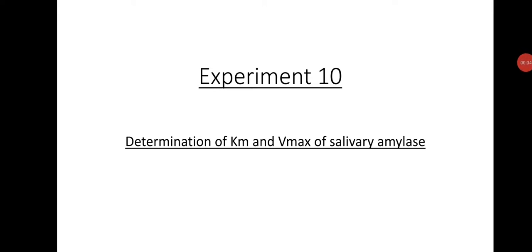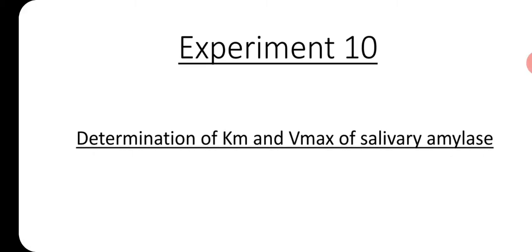So moving to the last experiment of BTY106, the aim of this particular experiment is determination of Km and Vmax of salivary amylase. So students, basically this enzyme is considered to be one of the basics of biochemistry because enzyme is involved over here. Well, I hope you all have gone through the topic of enzyme already in the class, or maybe you might be having that e-resources available with you.